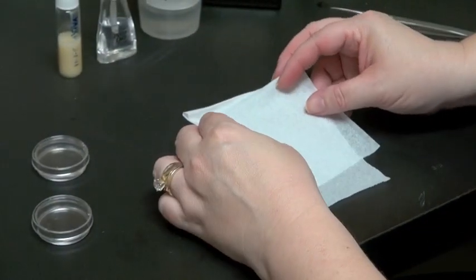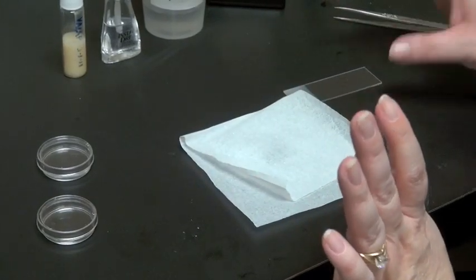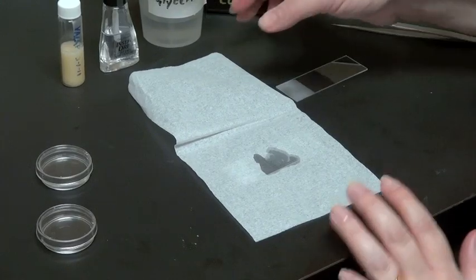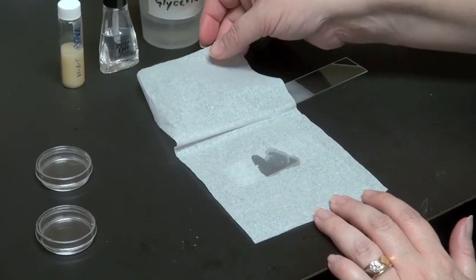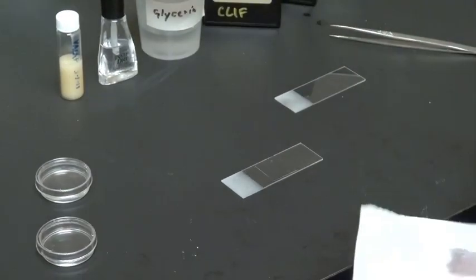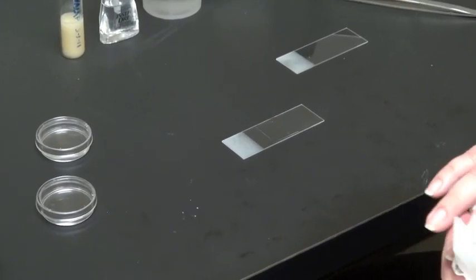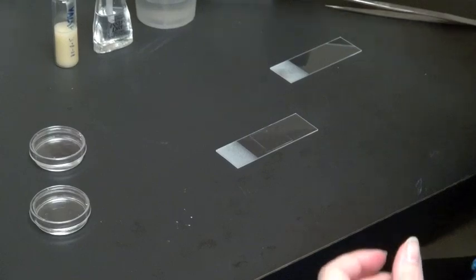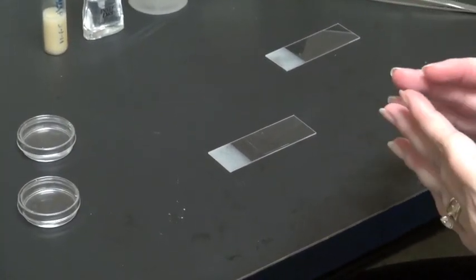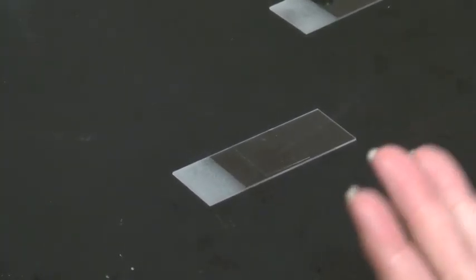Next, you want to take a Chem wipe and just lay it over the top. Don't press on it, just lay it over the top to collect any excess around the edges. Gently lift it up. Don't disturb your cover glass. And next we want to seal this so that the cover glass doesn't move during the time that we're imaging.